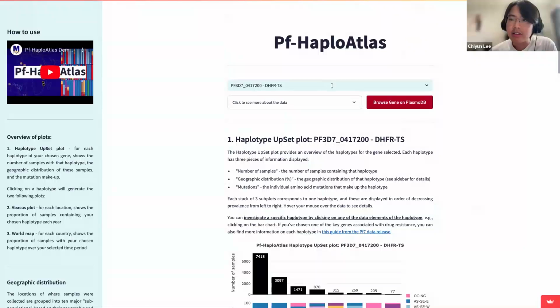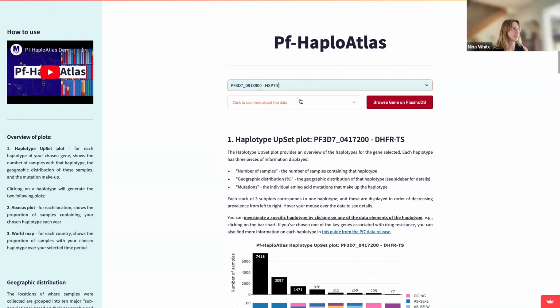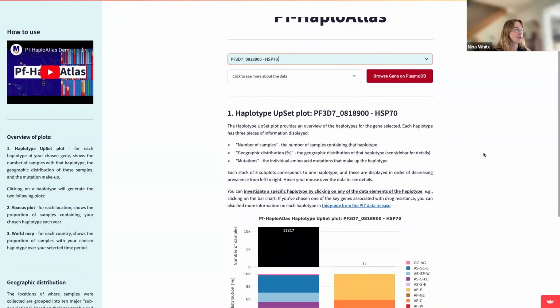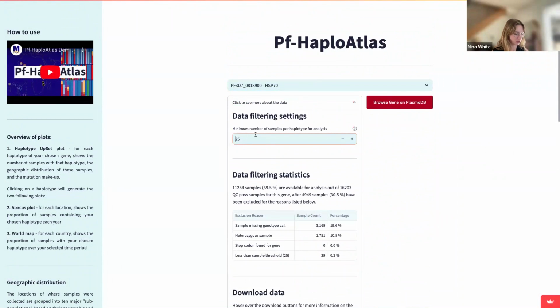There's been a question from the chat from Malaria, I'm not sure if that's pronounced right. They talk about HSP70 as a gene for us to study in the chat, and later on KDR. Should we start with HSP70, Nina? Yep, let's have a look. I don't think I've looked at this one myself yet. So with 25 samples, we can see 2 haplotypes. Should I lower the threshold, see if we change that a bit?